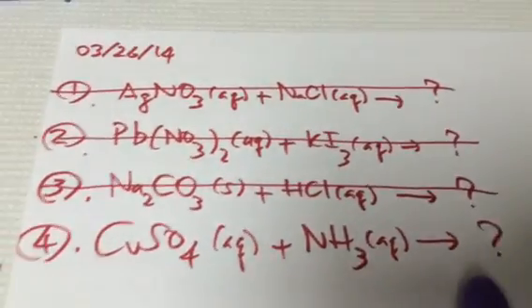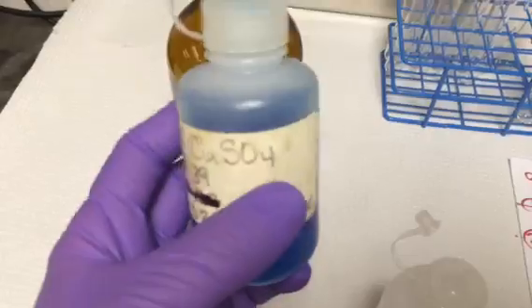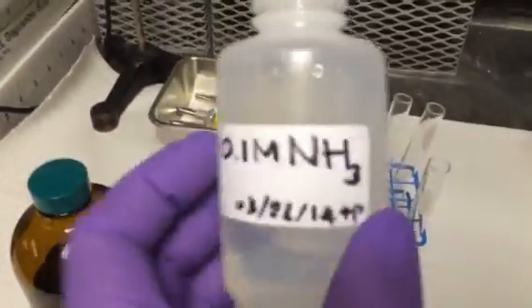So what is going to be the result? We have about 1 molar copper sulfate, blue color, and I made some fresh ammonia, part 1 molar. I put some in these clean bottles.